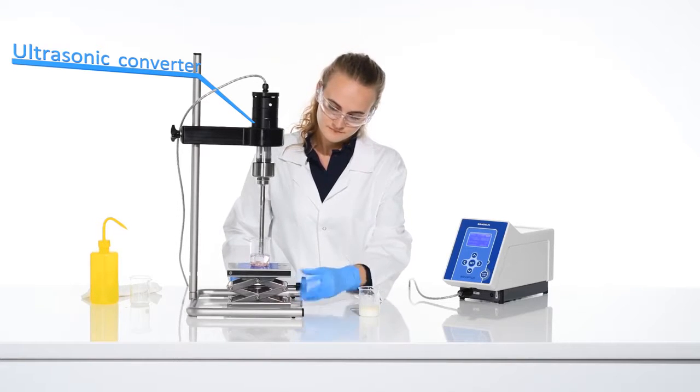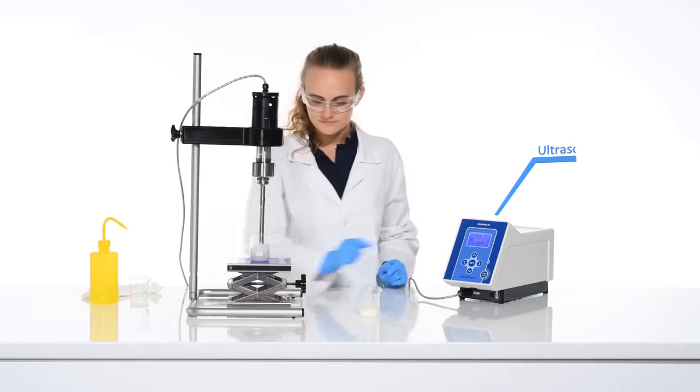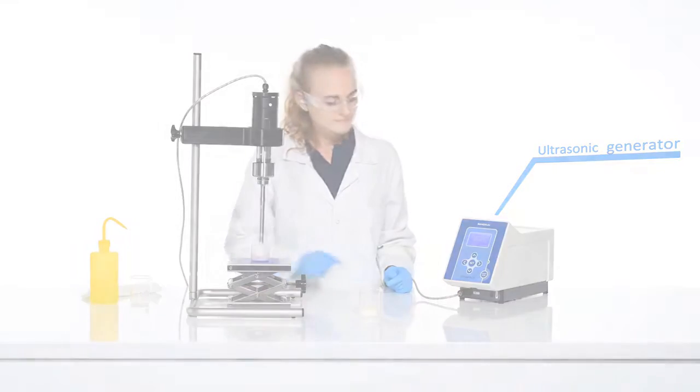To change samples, simply rinse off and dry the probe, then immediately treat the next sample with ultrasound. This facilitates an efficient laboratory routine by eliminating irritating intermediary cleaning steps.